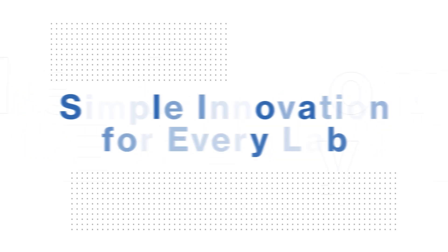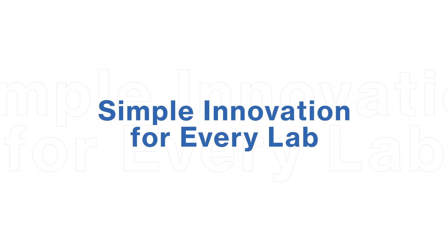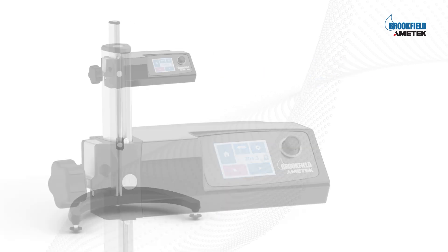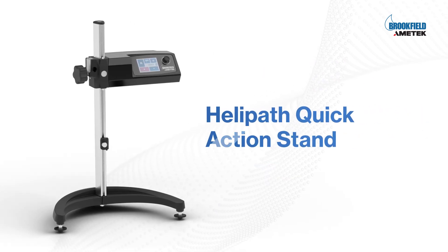First of its kind, simple innovation for every lab. Introducing the HPQA — the Helipath Quick Action Laboratory Stand.